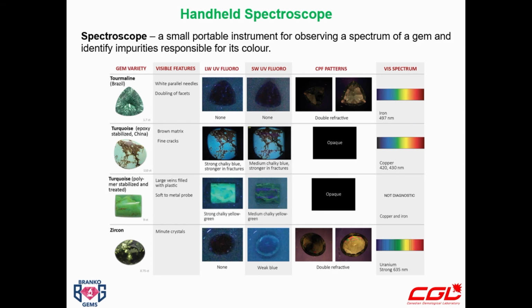Turquoise is a very complicated stone because there are many treatments. Some of you maybe went to Eric Fritz's lecture, different sources, different colors. So basically I acquired this in Tucson. This is in the Hong Kong show. The dealer told me this is a new green turquoise from Iran. And I have it here based on fluorescence. And I'll show later some spectroscopy here at the show.